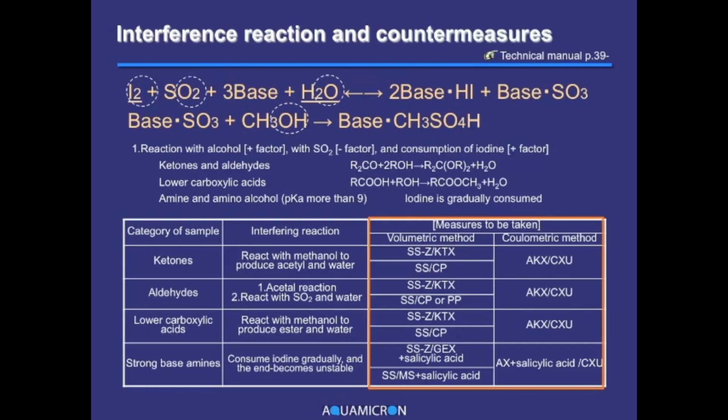The countermeasure against ketones, aldehydes, and carboxylic acids is to use the dehydrating solvent for ketones or the anode solution for ketones. In the case of amines, adding a weak acid such as salicylic acid into the reaction medium is an effective way to prevent interference.